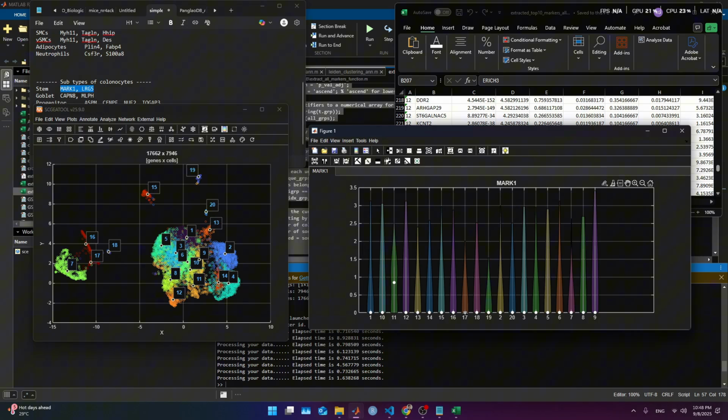I don't think this helps much. 14, 10th, number 5, 3, 5, 3 should be lighting up. I think if we, oh no, 11, yeah, very likely 11 is progenitor cells. So the 11 has that very well marked.